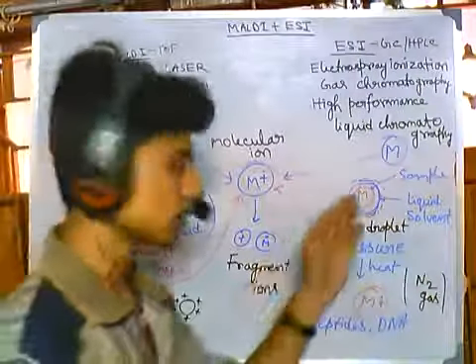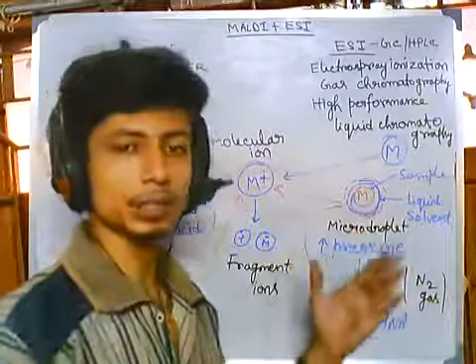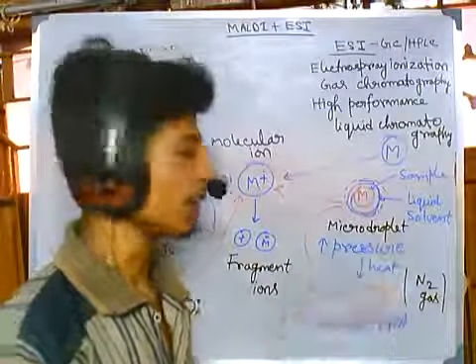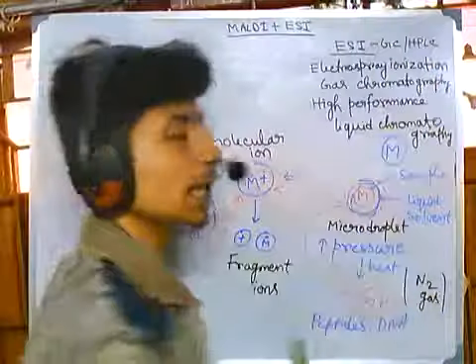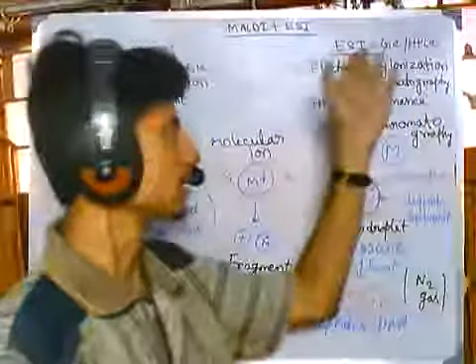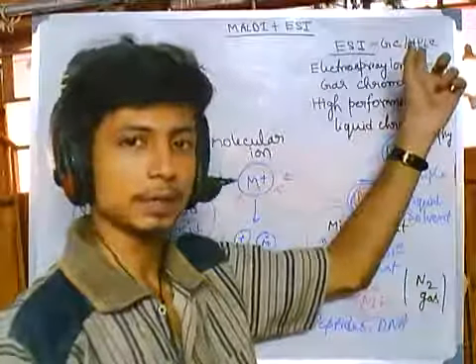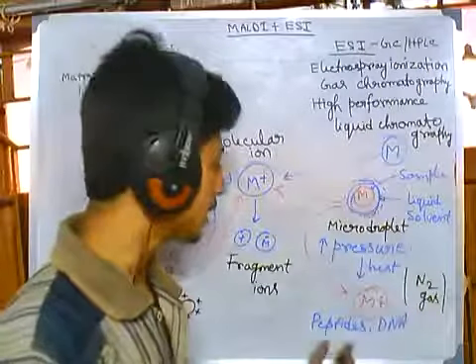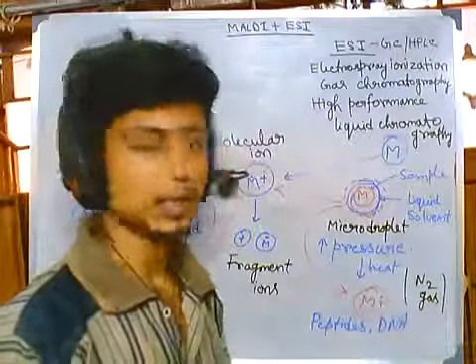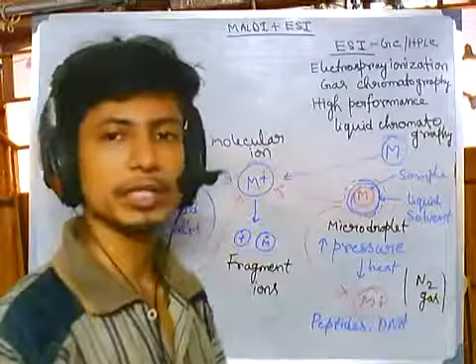Now after the whole process is done, as we are utilizing peptides and DNAs, which are large biomolecules, macromolecules, we need to attach other analyzers besides the mass spec, like gas chromatography or the HPLC analyzer, a high performance liquid chromatography analyzer, to finally detect the type of chemicals we are dealing with, because the molecules in this case are pretty large.